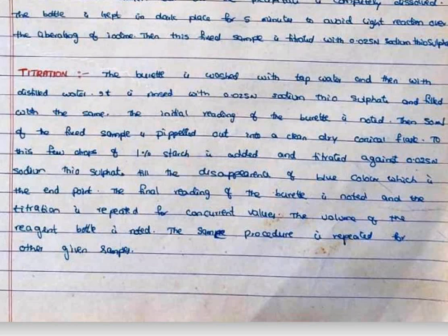Next, titration. The burette is washed with tap water and then with distilled water.